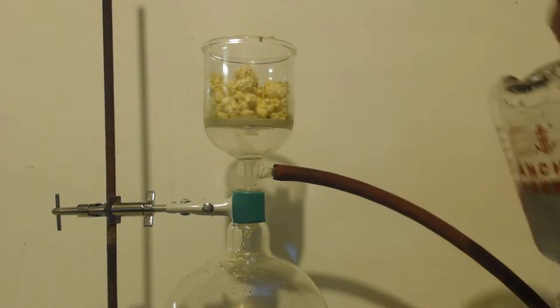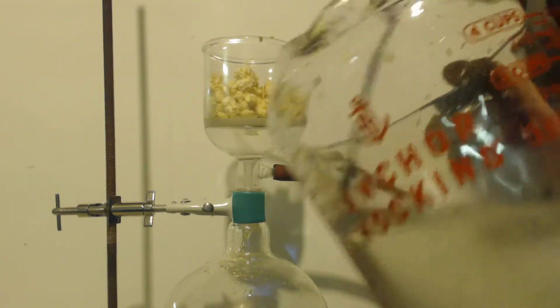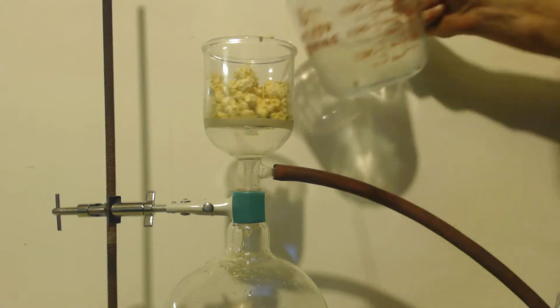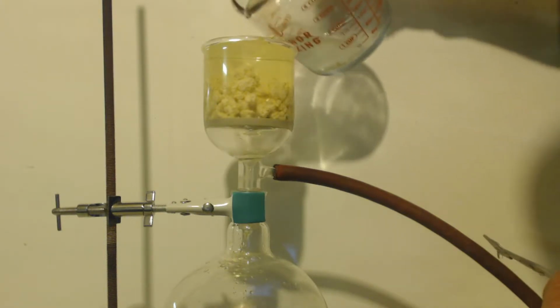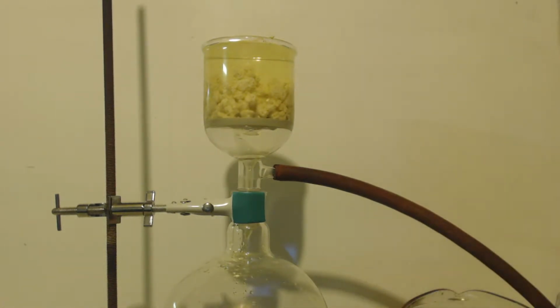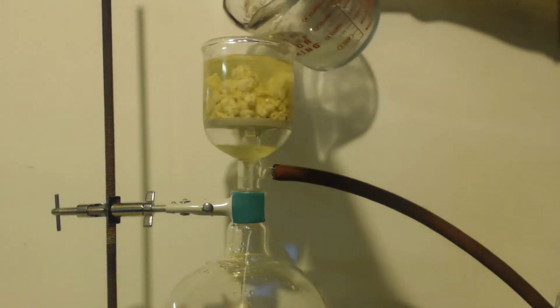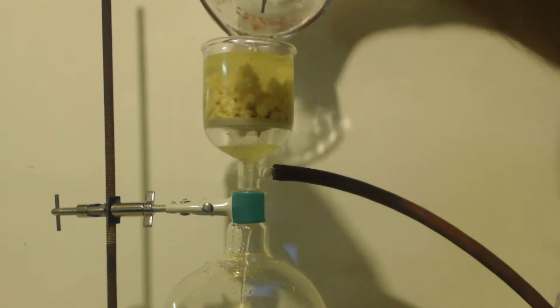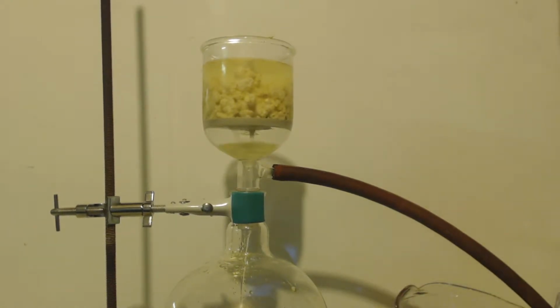And there you go. Finally got the solids in there. I got 500 milliliters of clean water. I put it in the same container, try and get some of this stuff out. I'm just going to wash it. There we go. Alright, we're going to let that drain, and I'll be back.